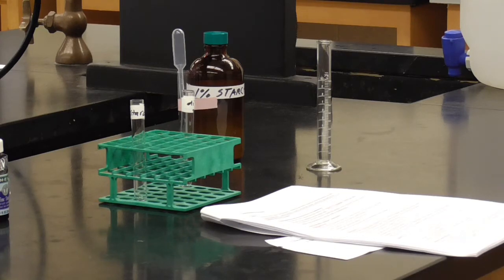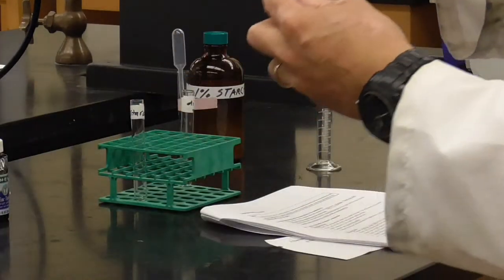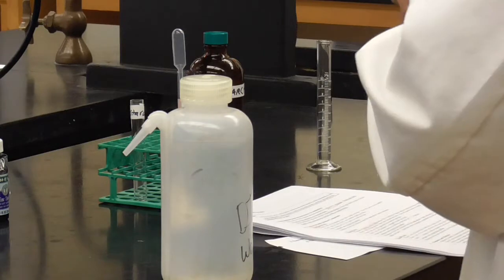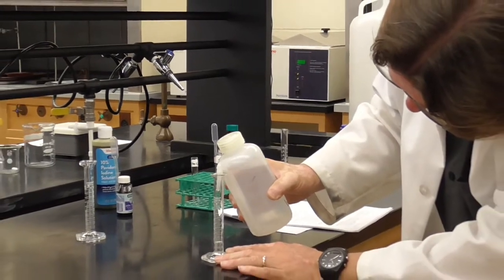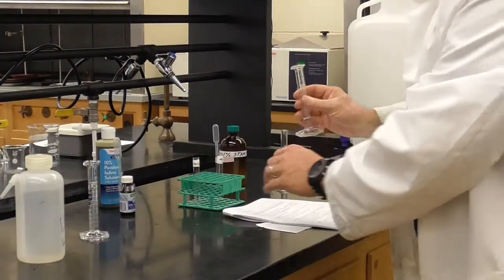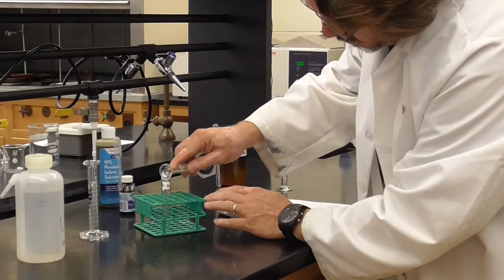All right, so let's go ahead and do this test. For the negative, again, we'll use water and 3 milliliters. So this was my water one. Oops, I went way too much on that. I'm going to try to make them kind of comparable, right? So let's try that again. There we go. 3 water. So here's my water test tube. Pour that in there.